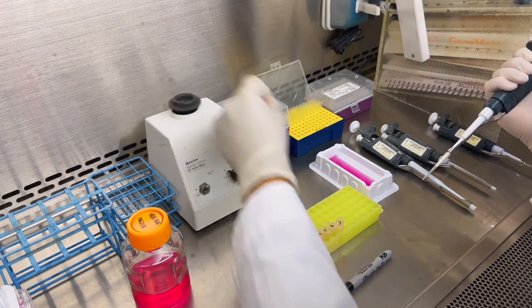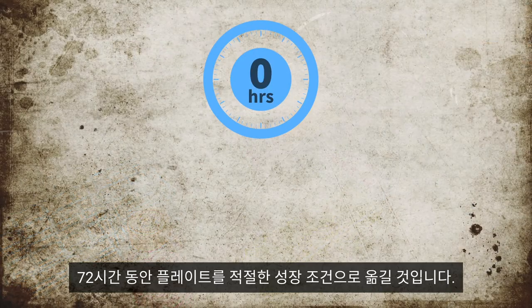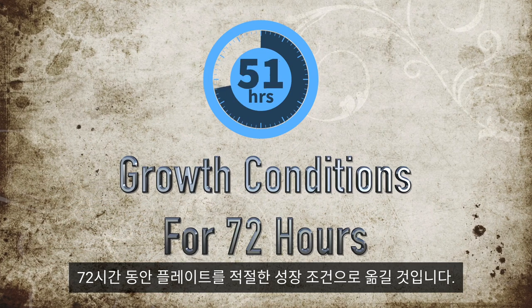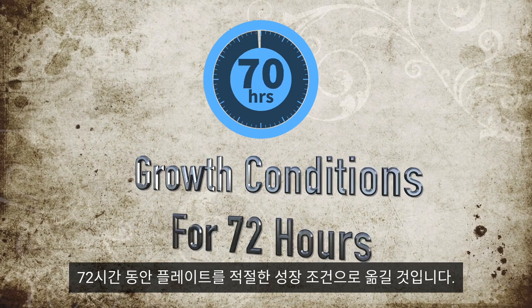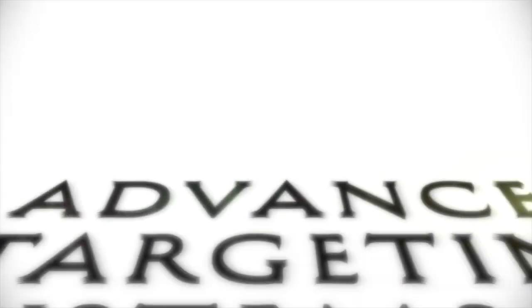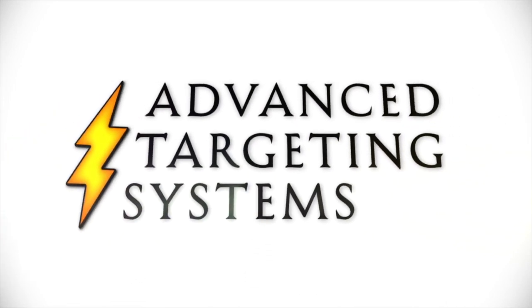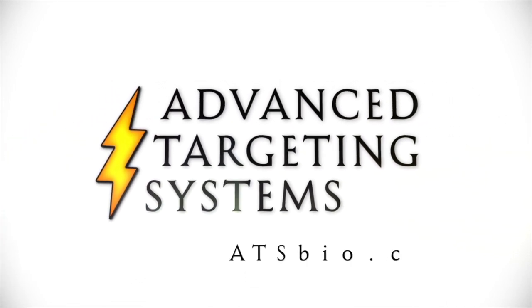Transfer the plate into the appropriate growth conditions for 72 hours.